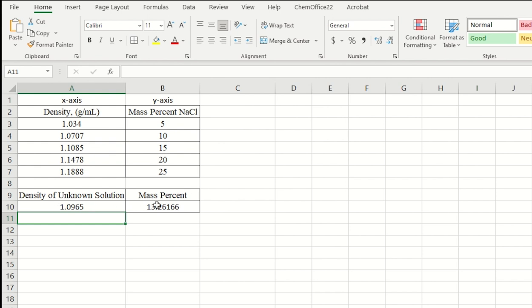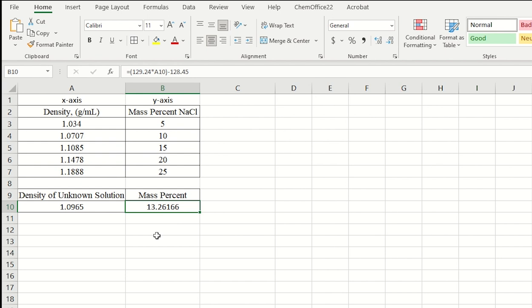And so this makes sense, actually. You can see here 1.09 is actually right in between this 1.07 and 1.1. So we expect a mass percent somewhere between 10 and 15 percent. And indeed, that's what we get here, 13.26.